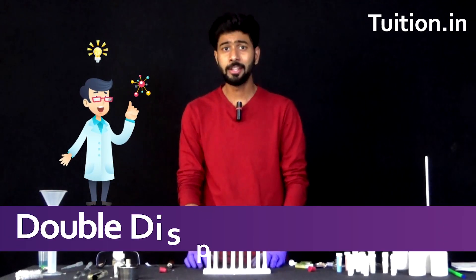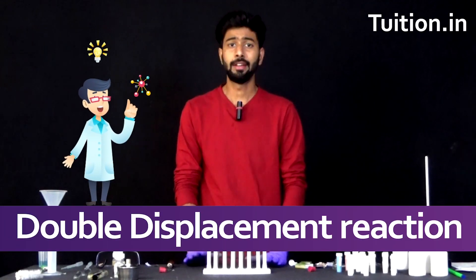Have you guys ever heard the term double displacement reaction before? If not, through this experiment it is time for you to learn that.